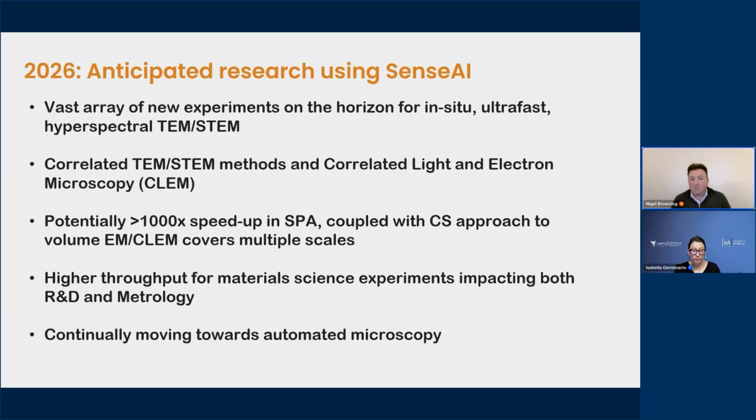From the TEM and STEM side, we can also look at going into an SEM side, correlated light and electron microscopy, because the reconstruction approaches using the dictionaries we use for the compressive sensing will also work for optical systems, and also work for different resolution between images. And so that allows us to transfer images between both the optical and the electron microscopy side of it.